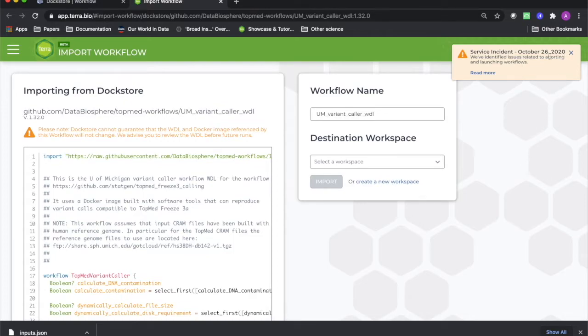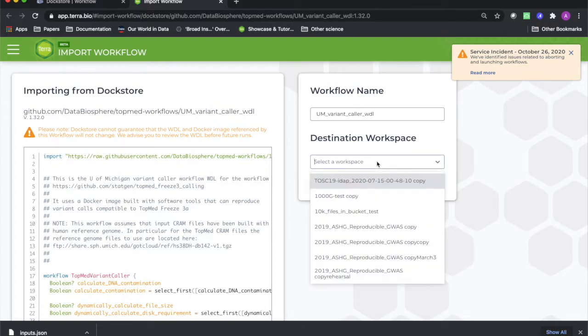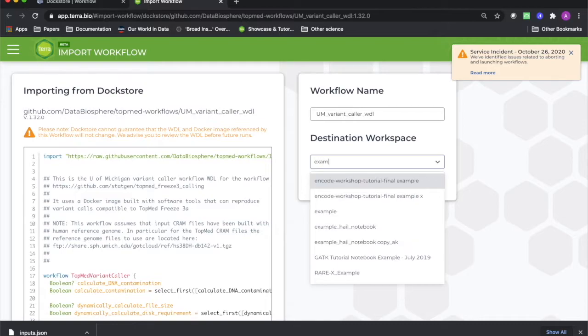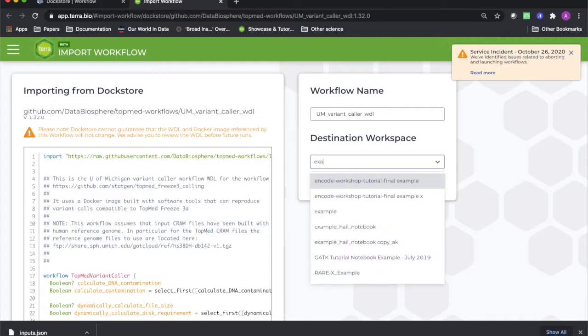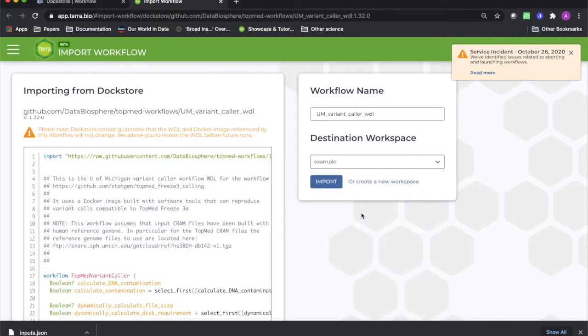When you click this button, a new tab will open with the Import Workflow screen in Terra. Simply type in the name of the workspace where you'd like this workflow to show up and click Import. You can also click Create New Workspace to make a blank workspace containing only this workflow.